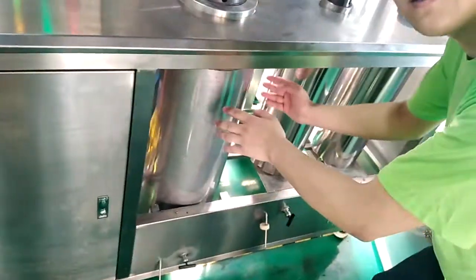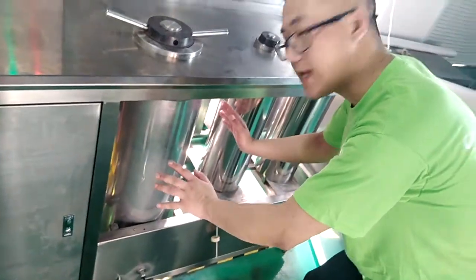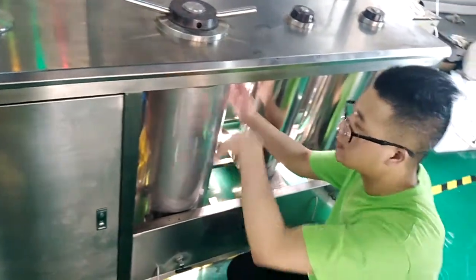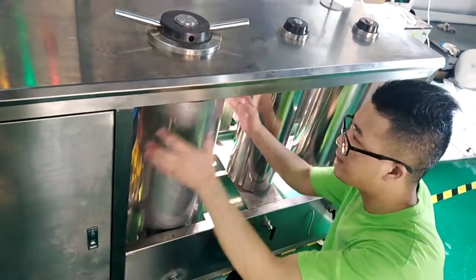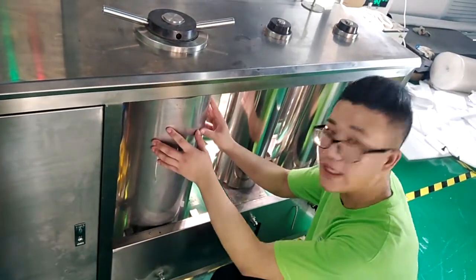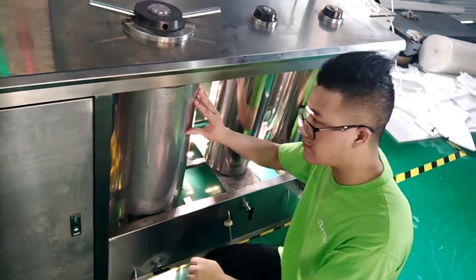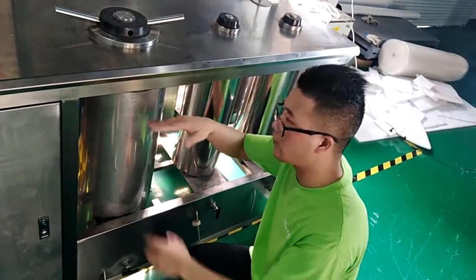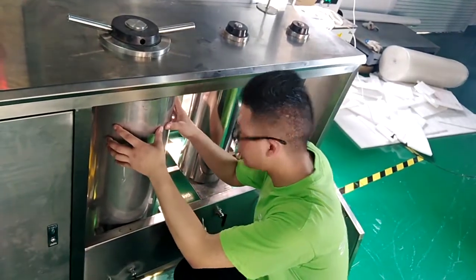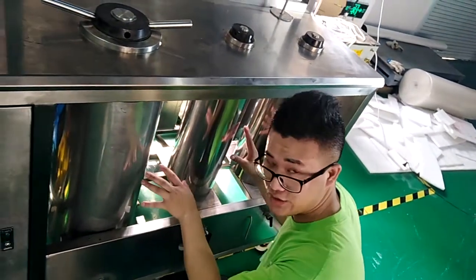As mentioned, the vessel is 5 liters capacity, but you can see it's very large. Actually, there is a jacket around the vessel, so it appears large. Inside the jacket is water. With the help of the water circulation pump, hot water will circulate inside to keep the extraction vessels and also the separation vessels at a warm temperature, as desired.